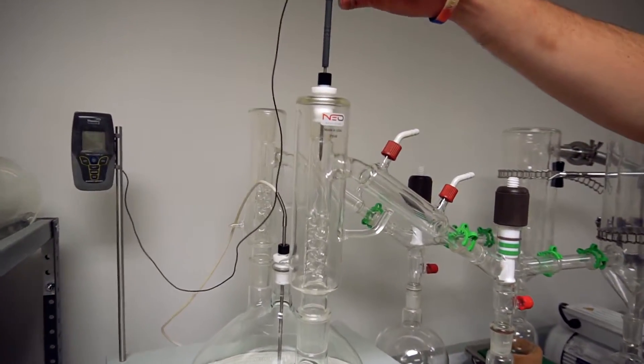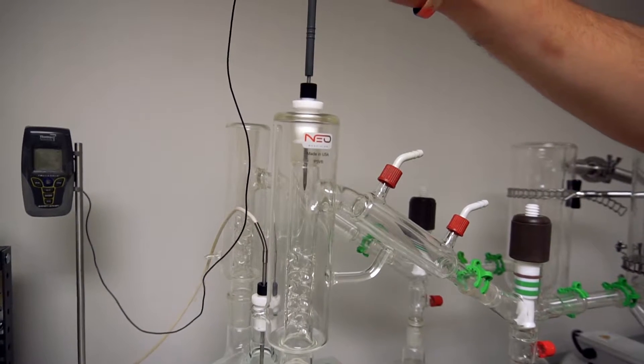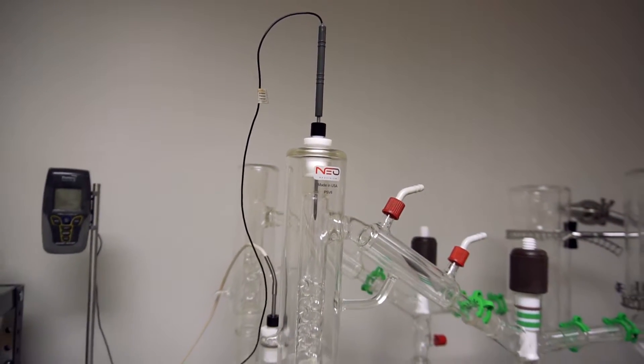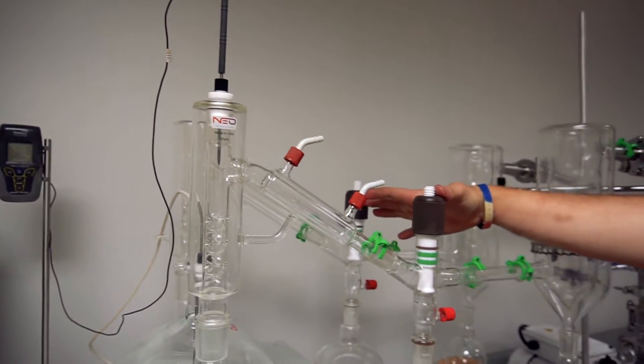Right now you can see a kangaroo thermometer in here. It's also swappable with a glass thermometer. We have these two vacuum valve adapters.